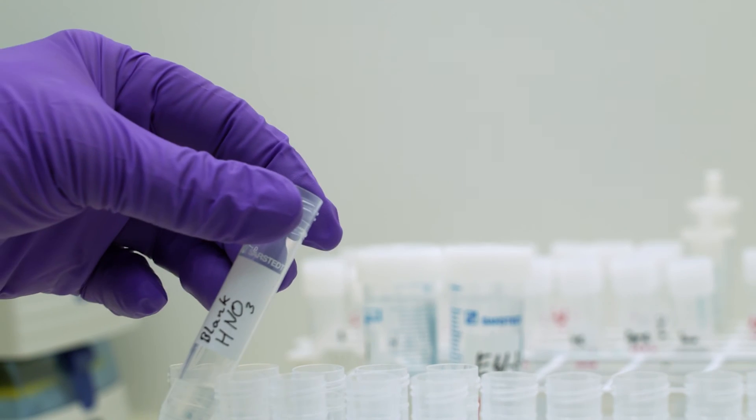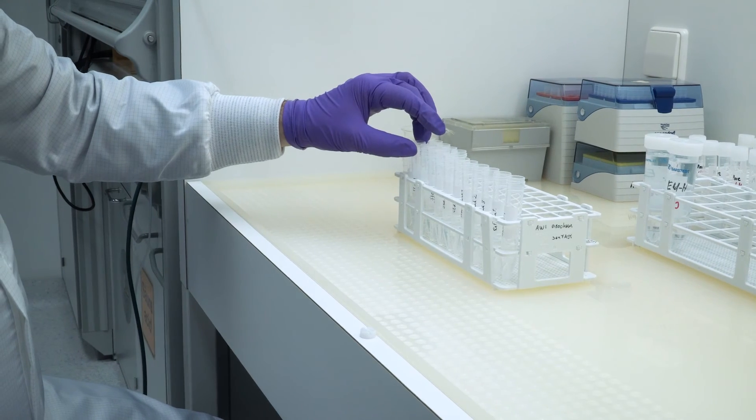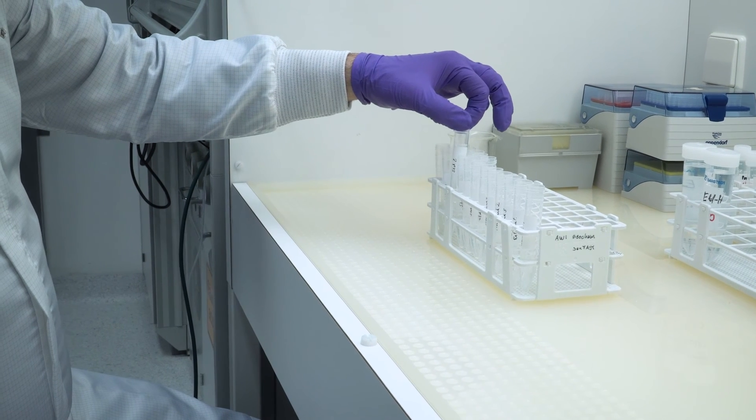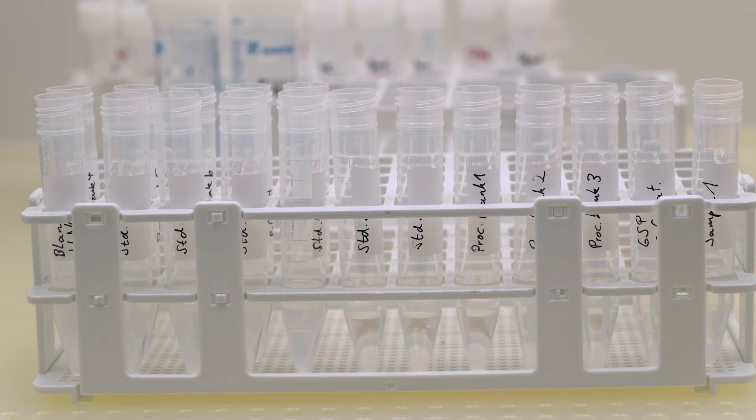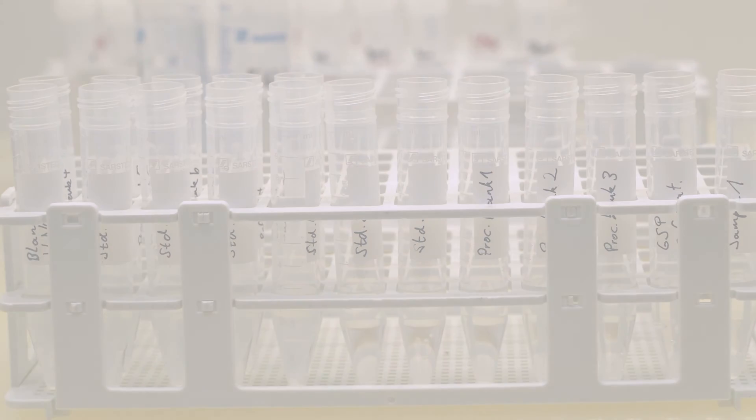Regardless of the type of instrument used, if you want to generate reliable data from marine samples, there are some important analytical considerations that we show in the video, calibrating and validating analyses of marine samples.